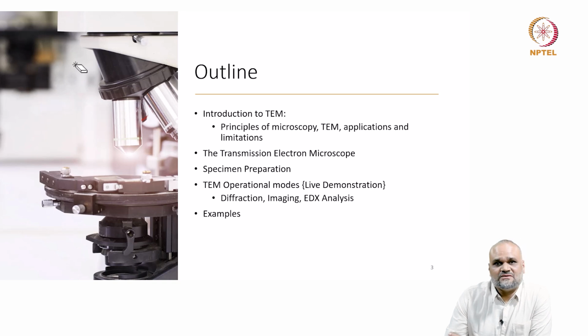In this particular course, I'll be focusing on transmission electron microscopy, where you can get structural information, morphological information, as well as compositional information from a single technique. Here is a brief outline of the course. I'll be running through some basic principles of microscopy, the transmission electron microscopy in particular, the applications and limitations.